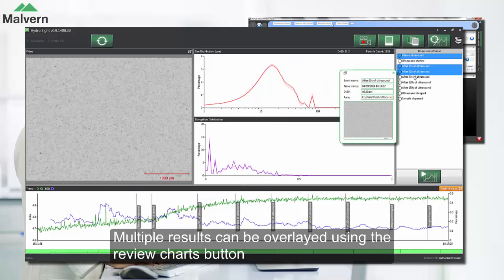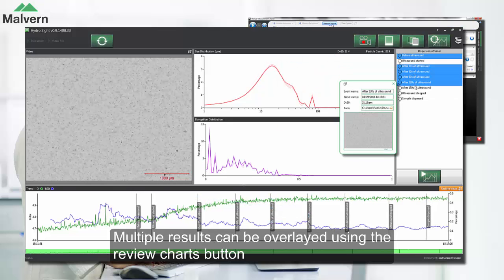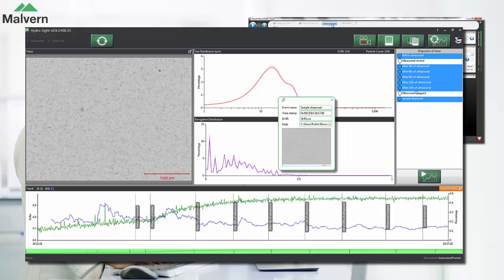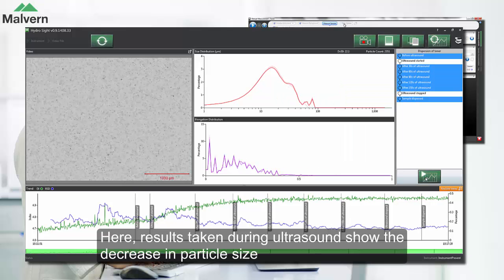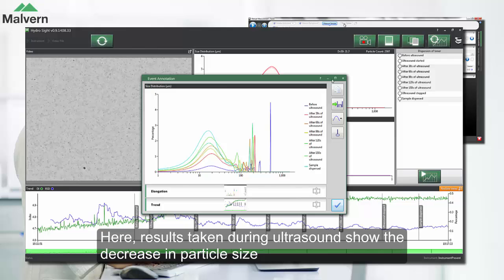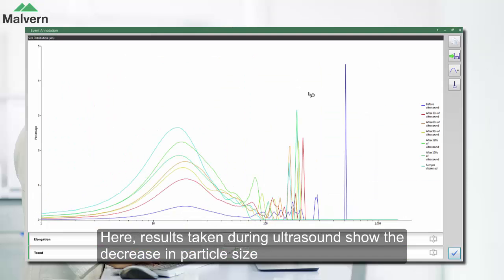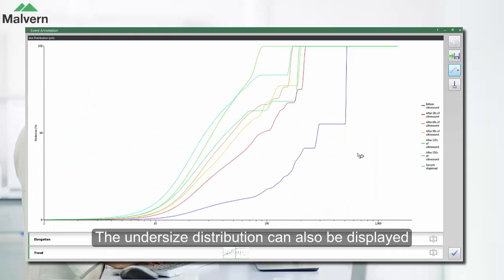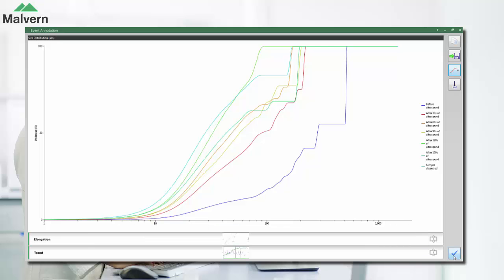We can overlay multiple results from different points in the dispersion process to look at the change in the particle size distribution with ultrasound. Here we can see the decrease in particle size with ultrasound, which can also be displayed as an undersized curve.